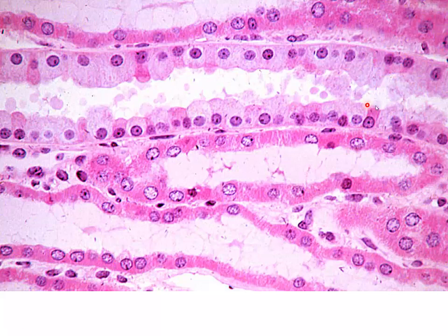Again, mostly what we're looking at are principal cells, but then again, we will see our red staining cells, cells projecting and dome-shaped at the surface. These are going to be our intercalated or PEG cells that are characteristic of our collecting ducts.